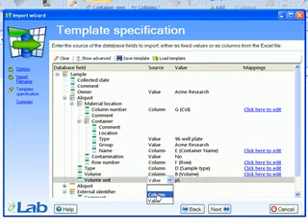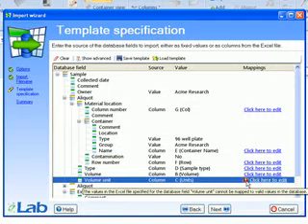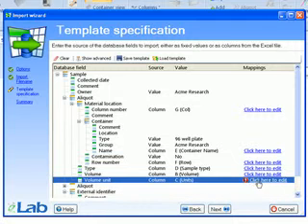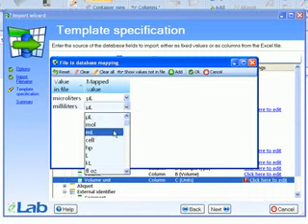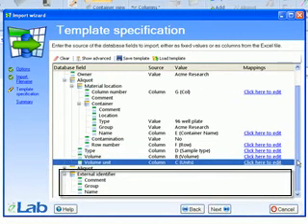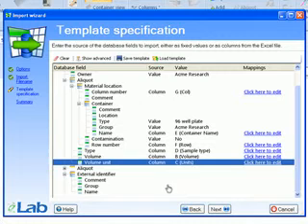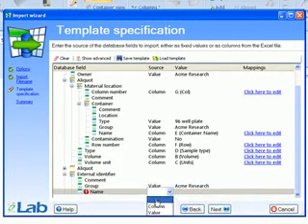Notice again we get the validation icon when we set the Excel column for the volume unit. To fix this error, open the mapping window and make a mapping between the Excel values and the values in the database. To enter the customer's own identifiers, scroll down to External Identifiers and enter the details there. If there is more than one identifier, you can continue to scroll down and enter more.